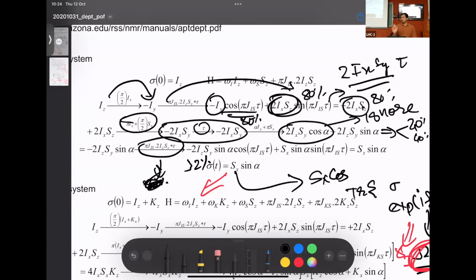Right? So did you guys understand the point that is being raised? As you keep extending the pulse program, you're going to have losses that are going to happen for every step. So you want to minimize the number of steps that exist. There used to be times where spectrometers did not cater to very good pulse widths. The 90 degree, 180 degree had a lot of off resonance effects. So people wanted to reduce the number of pulses because the pulses were imperfect.